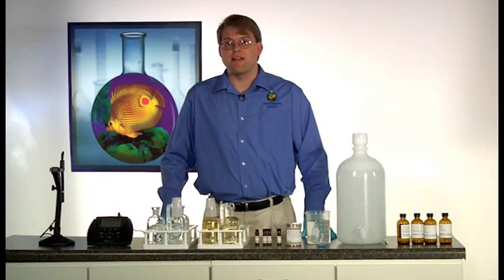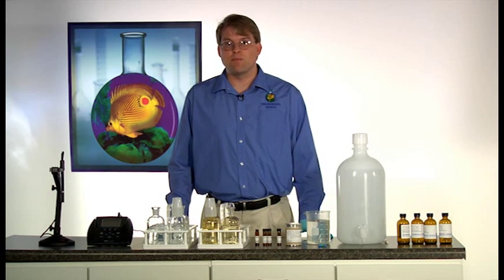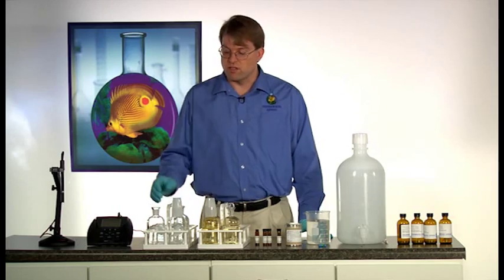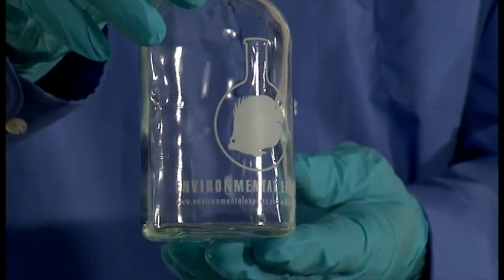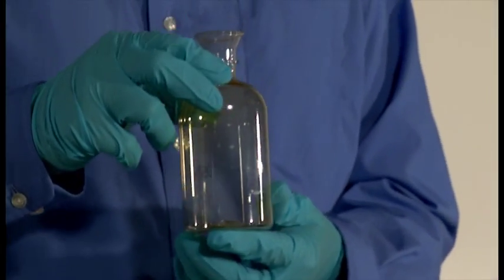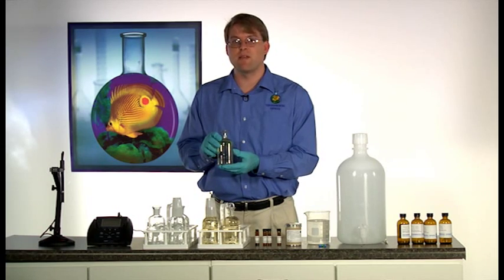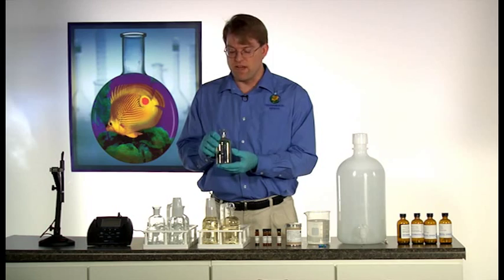After you have obtained adequate dilution water and prepared your seed and added your standard, you need to decide which bottle you would like to use for your BOD batch. Traditional glass bottles or plastic bottles are available for use. These plastic bottles are specially designed and approved by the EPA for use in the determination of biochemical oxygen demand and dissolved oxygen.